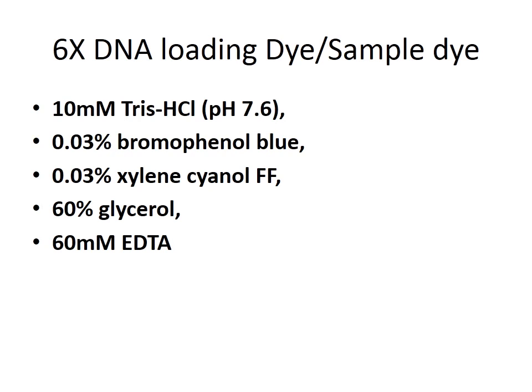Now, when we add DNA to the gel, DNA is loaded into the wells. A well is an empty space in the gel where the sample could be loaded. Now DNA samples are colorless and they are also aqueous solutions. The buffer which is used for electrophoresis is also an aqueous solution.